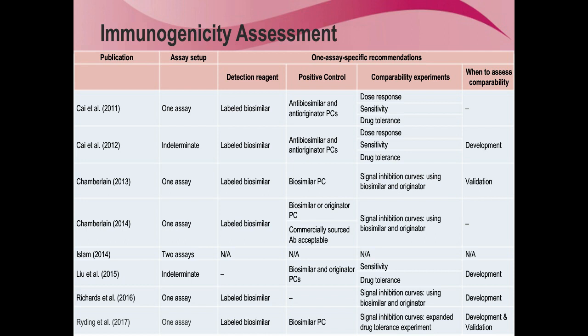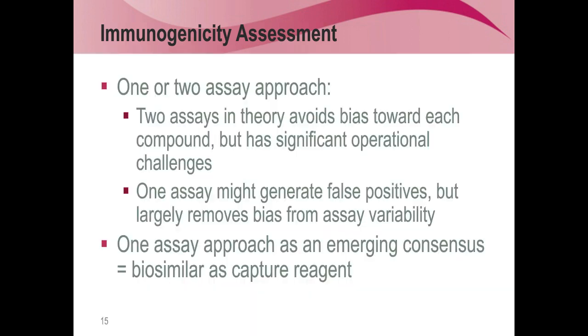So here it is, the one or two assay approach. It of course has advantages and disadvantages. Two assays remove any bias between the two compounds, but of course that means you have to measure every sample twice.